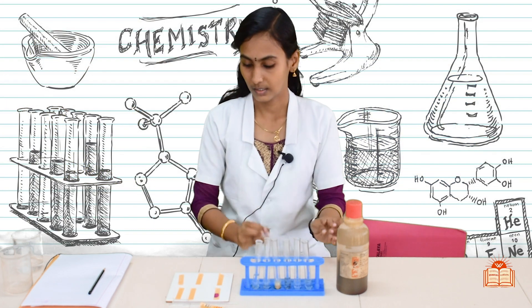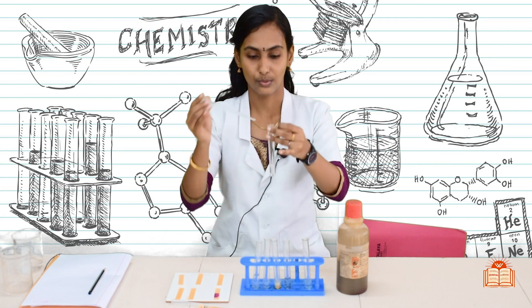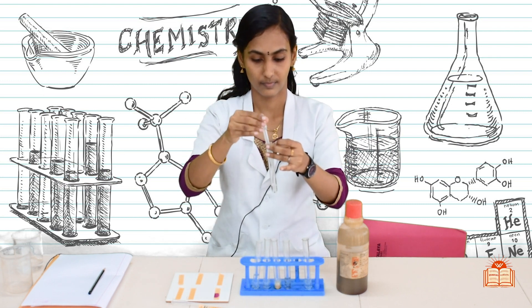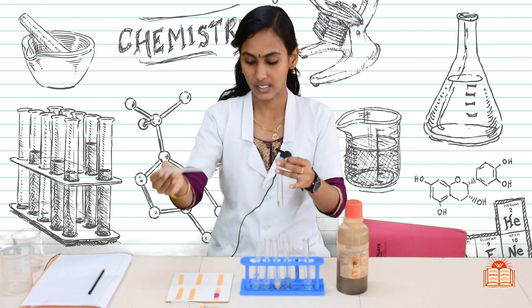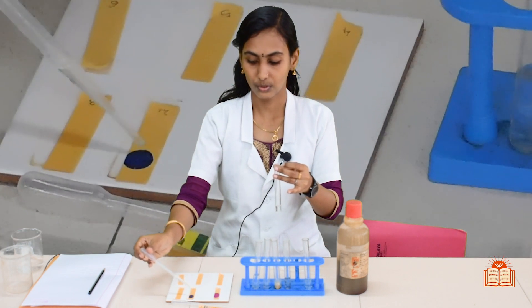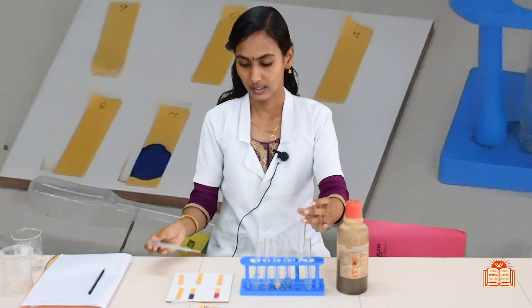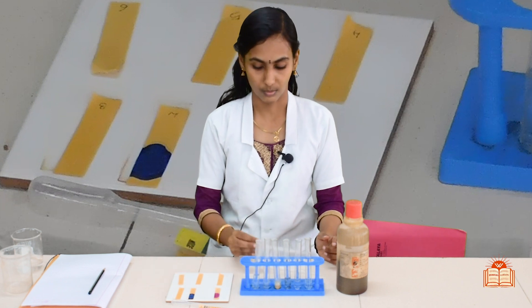Next one is dilute NaOH solution. Take some drops of dilute NaOH solution and add those drops to the pH paper. What is the color that you observed? It is dark blue color.